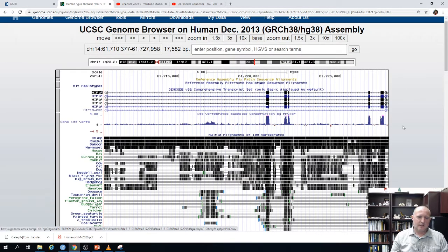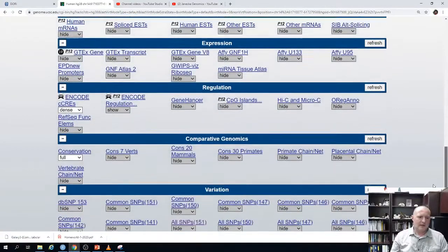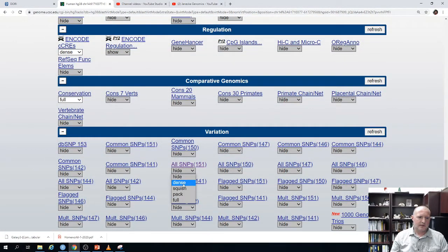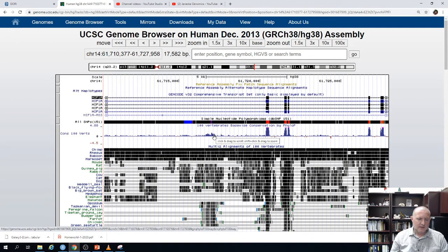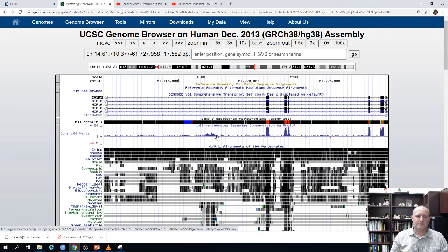If we go back to our SNP dataset and bring it back, I was going to see whether it matches the non-coding SNP region — it doesn't really match it very much. I don't have a good explanation for why that part of the intron would be conserved, but it most likely has an unrecognized functional site. Introns can have regulatory elements and sites important for splicing. If you see something like that, you could potentially explore it further to see if that sequence plays some sort of functional role.